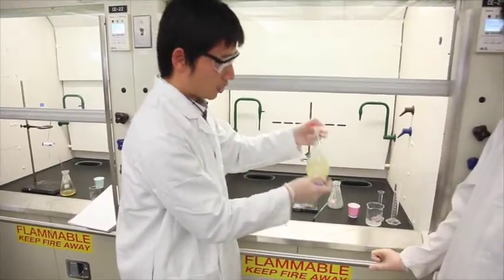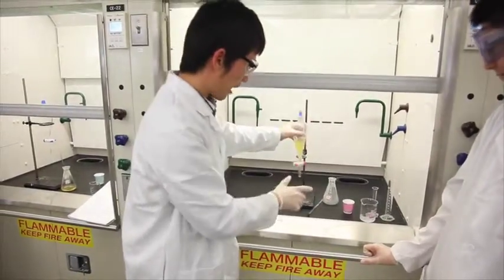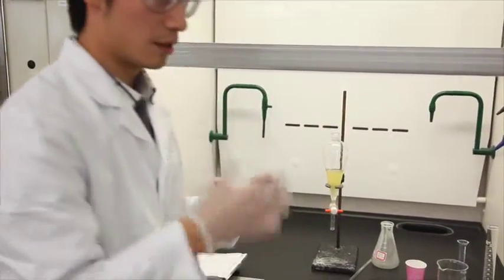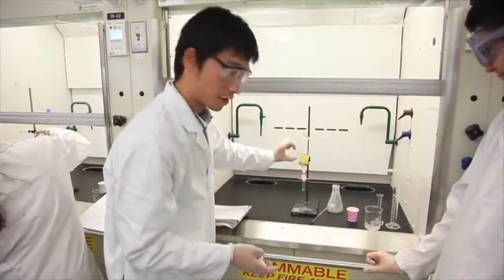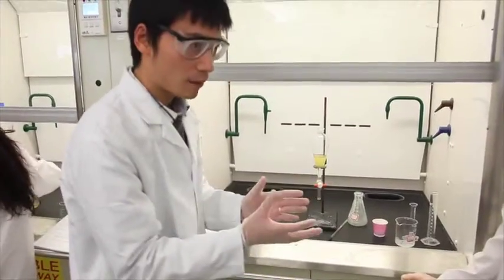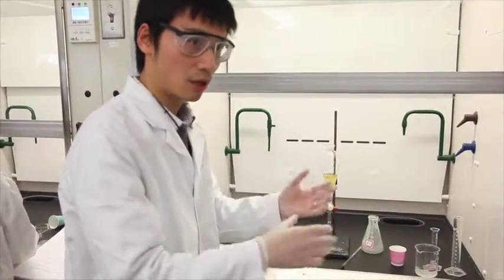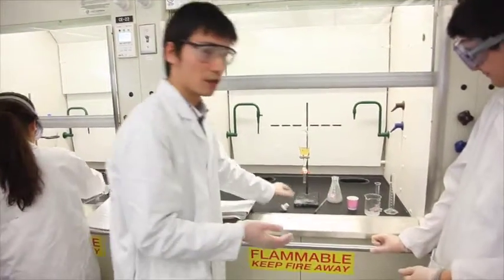So when you shake it and vent a little bit, then you put it back on the ring stand. And you need to open the cap here, so the pressure will equalize with the atmospheric pressure. So just wait until two layers form. When we're going to separate the two parts, you draw off the bottom layer from the bottom, and the top layer from the top, because you don't want cross contamination. So you can do it yourself.